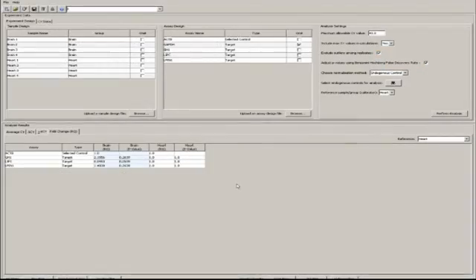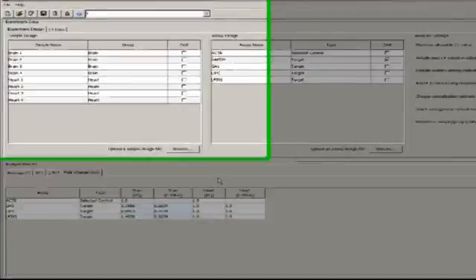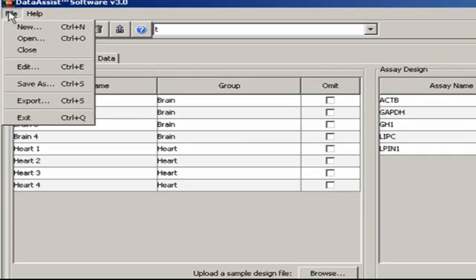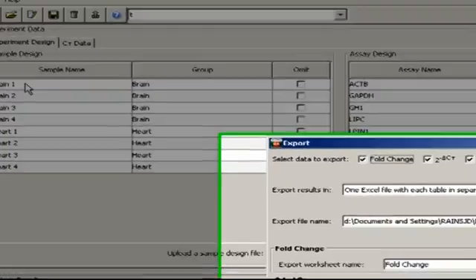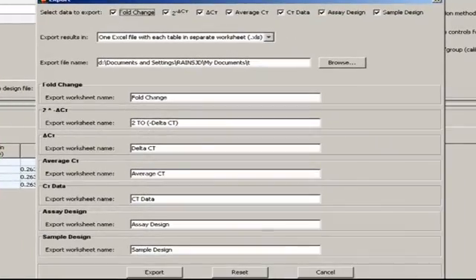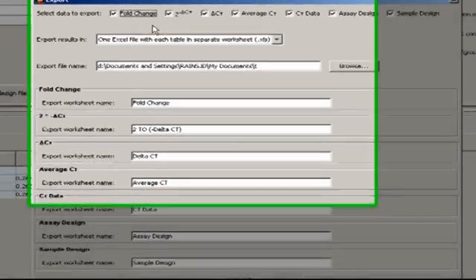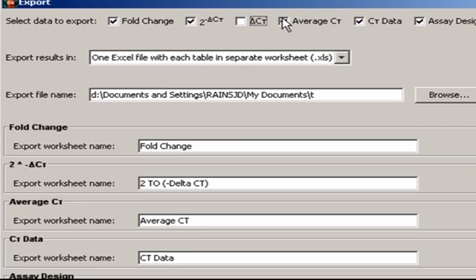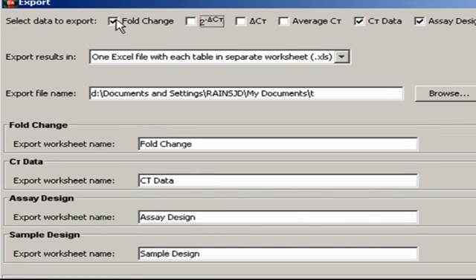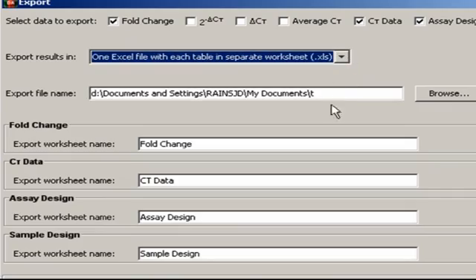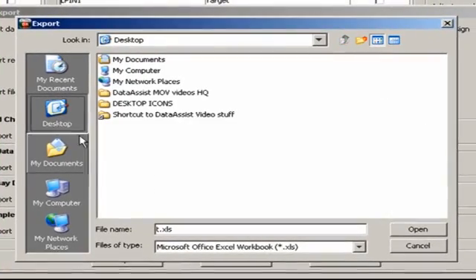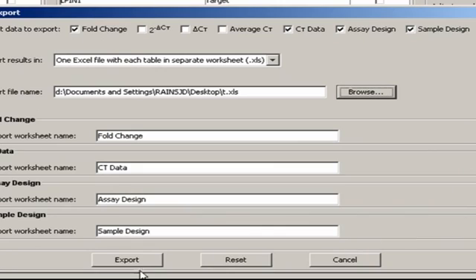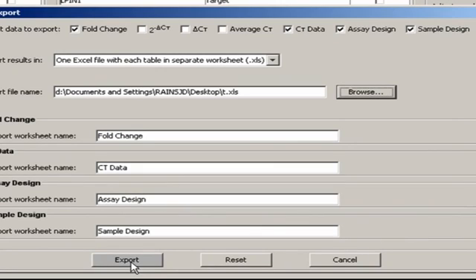The last thing we want to do is export our data. This part's easy. Just go to File, Export. A pop-up window offers several choices. For example, you can choose to uncheck any data that you don't want included in the final report. And you can choose from a variety of delivery options and export file types. Once you've chosen a destination site on your computer, just click Export.